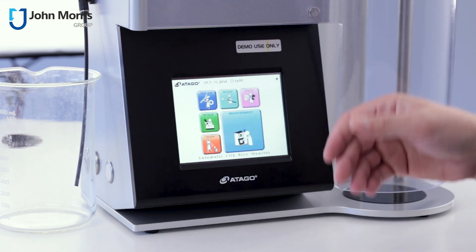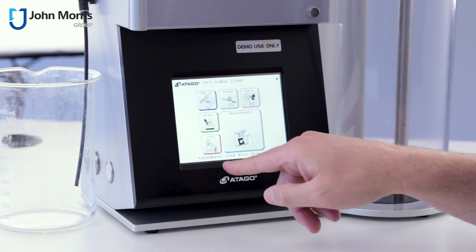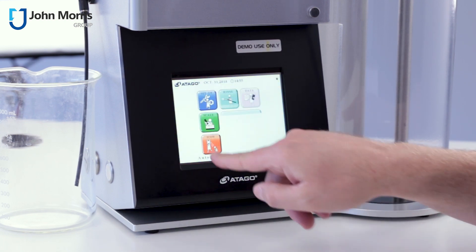It's got lots of lovely little features — again, who needs it? — but you can change the icons to look more attractive for you. And we're going to go with this one right here. So let's give this thing a spin.